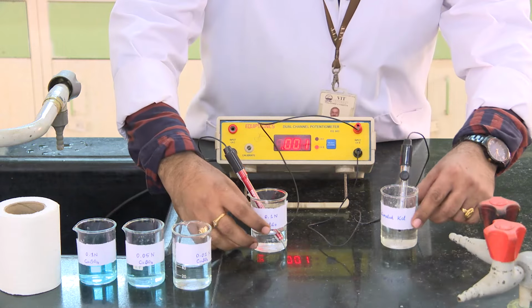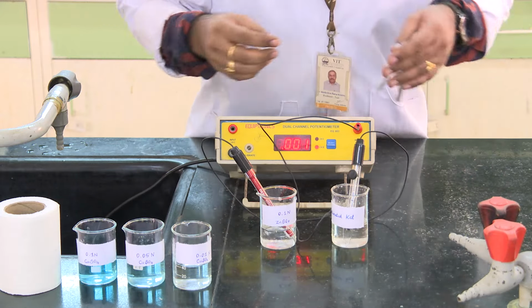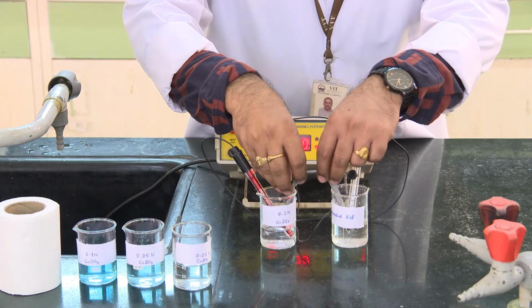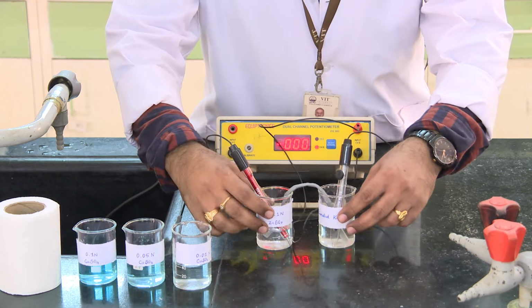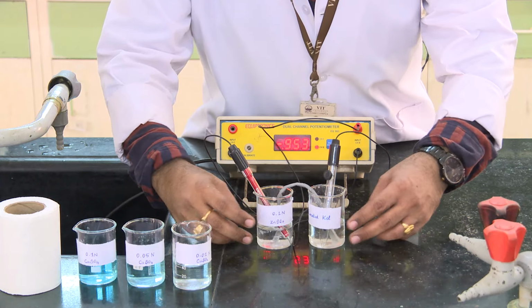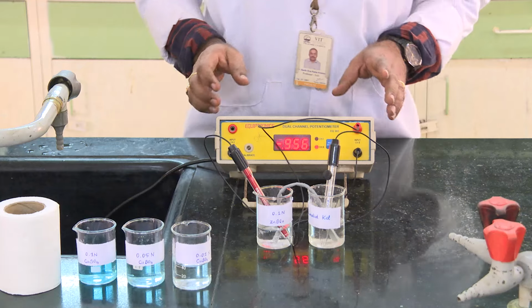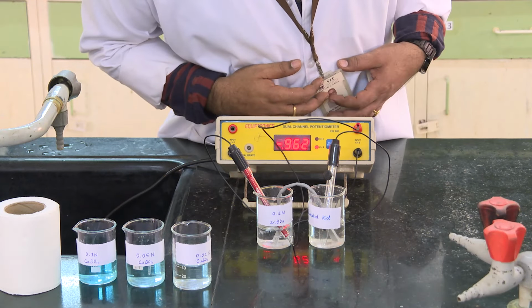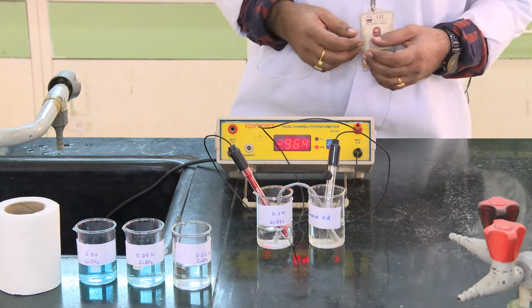Now I am going to put them together through a salt bridge. Then immediately you can see the appearance of the potential here. It is going to be in the negative values, so it is going to be minus 0.962 volts.